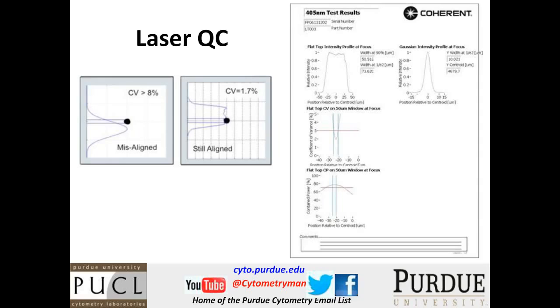So, for example, in cell cycle analysis, which I'll mention later, that's actually critical, and you need to be very, very careful. And we'll talk about why the Attune, I think, has some really nice advantages there.